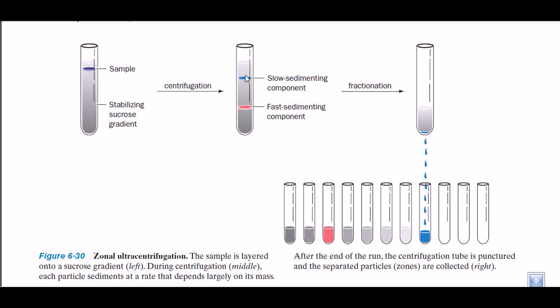So whatever we are talking about, this sedimentation is based on the mass of the molecule, and the sedimentation gradient is provided by the matrix, which in this case is sucrose. Okay.